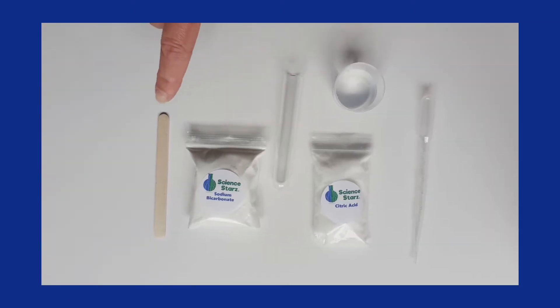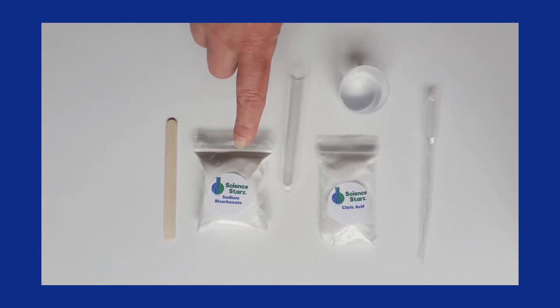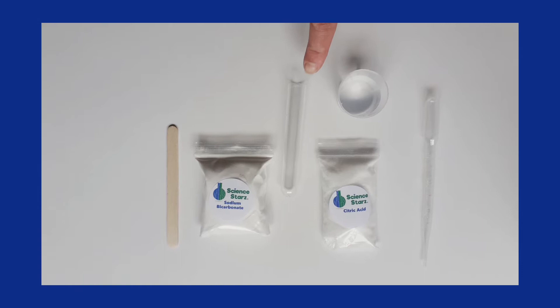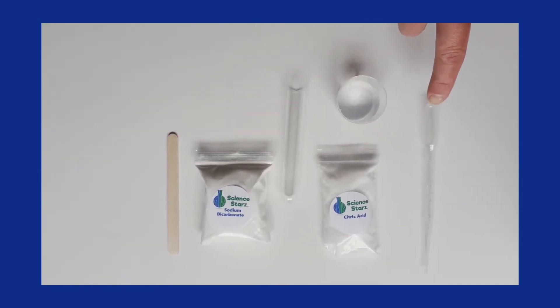For this experiment you're going to need a stir stick, some sodium bicarbonate or baking soda, a test tube, a beaker with water, citric acid, and a pipette.